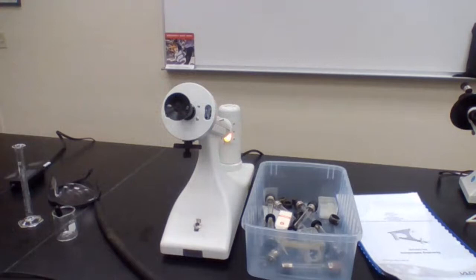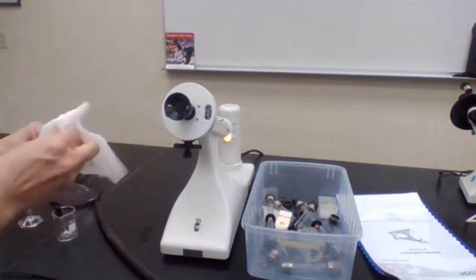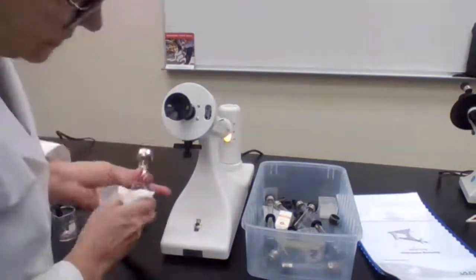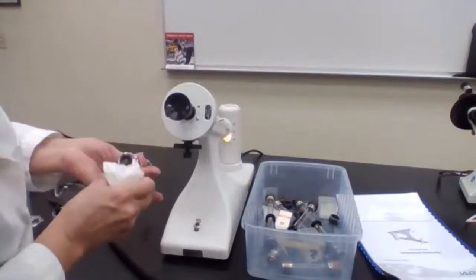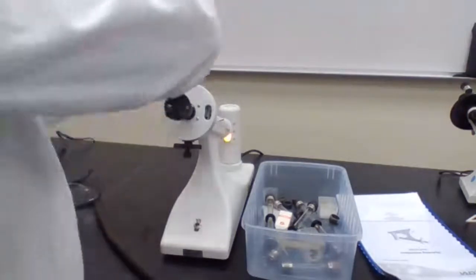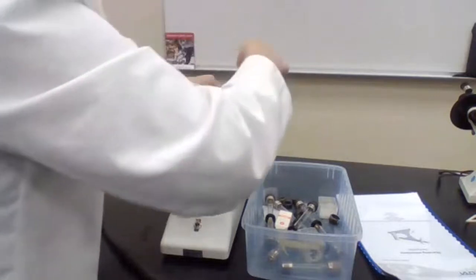I try to bring the camera for you to see how many degrees it has been rotated to record the observed rotation. There's no guarantee that you will see it because it's a very, very tiny eyepiece here.